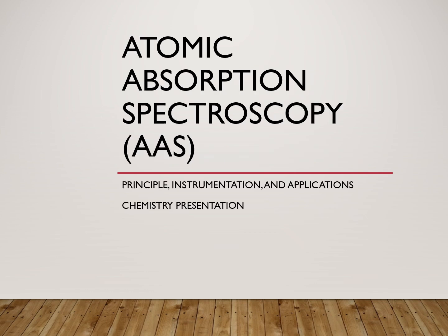Today, I will be presenting an important analytical technique known as atomic absorption spectroscopy, also known as AAS. This technique is widely used in analytical, environmental, pharmaceutical, and industrial chemistry for the quantitative determination of metals.